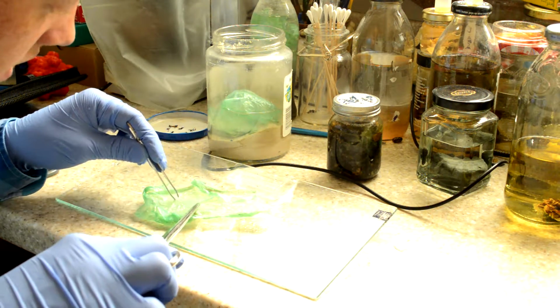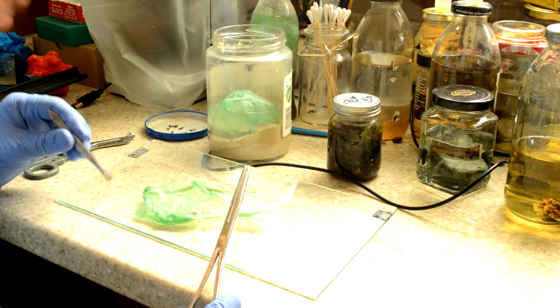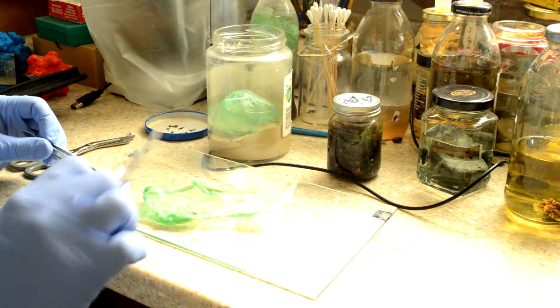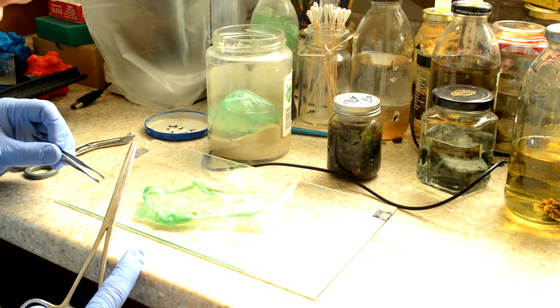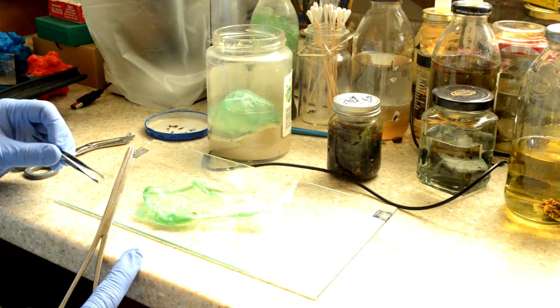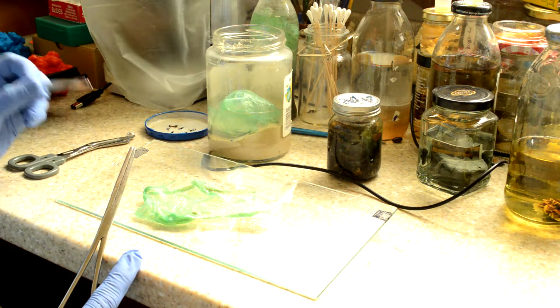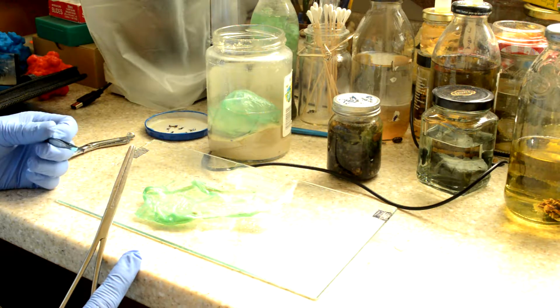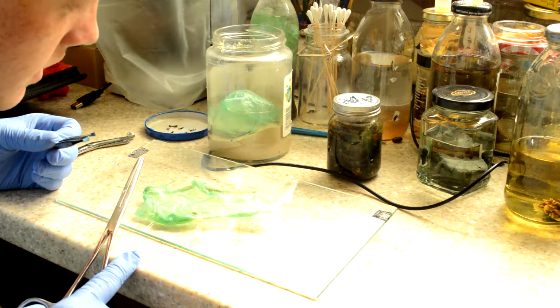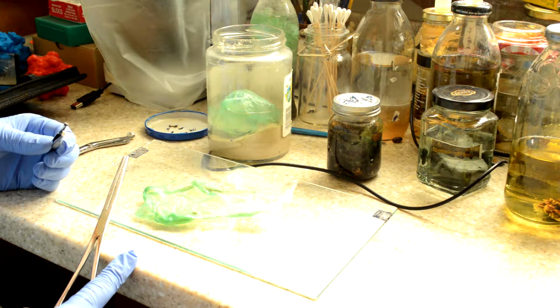It's much softer. It can be cut more easily, and it looks a lot clearer. Pigment has definitely gone in this sample, that's for sure. So as for anything like the freshwater where we saw a worm, just from looking at it on the table, I don't see anything like that here, but let's put it under the microscope and see what we have.